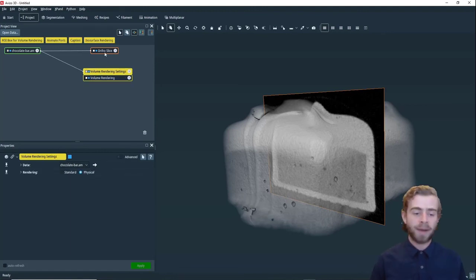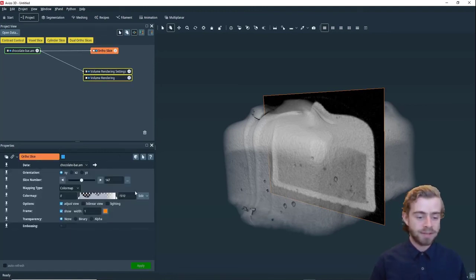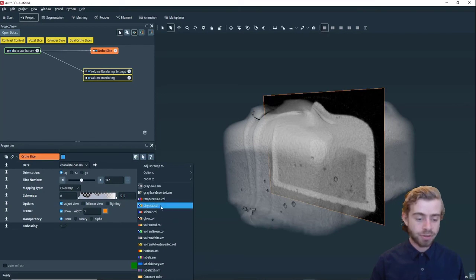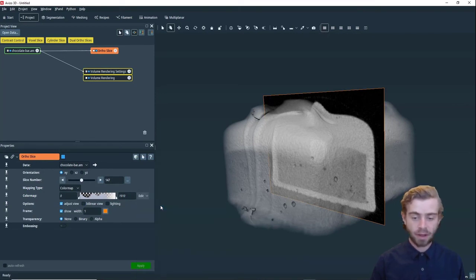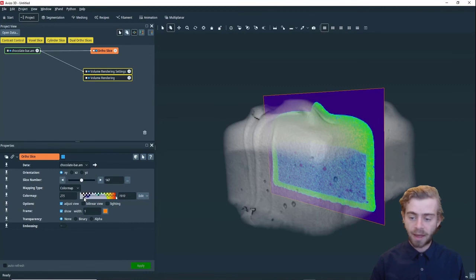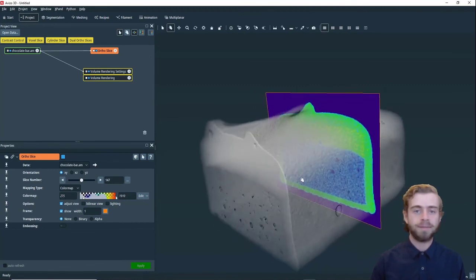So next, let's go back to the ortho slice and we're going to apply a different color map. So we're going to choose physics color map. So now let's just adjust this up a little bit. All right, so that looks good.